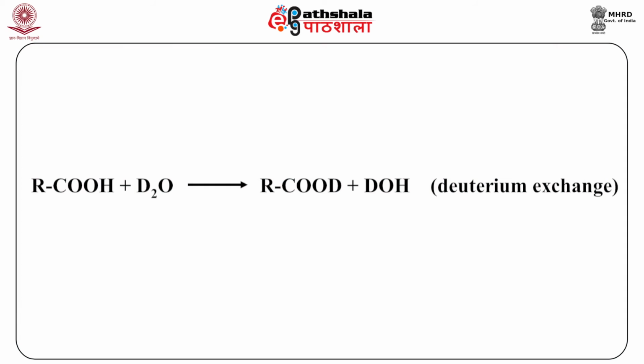The carboxylic proton is acidic, students, as you may know, because that is why it is known as an acid, and may exchange with water and D2O. In D2O proton exchange, the COOH group will convert into COOD by the exchange, and hence a peak near 12 ppm will disappear and a new peak will appear due to the hydrogen of DOH.